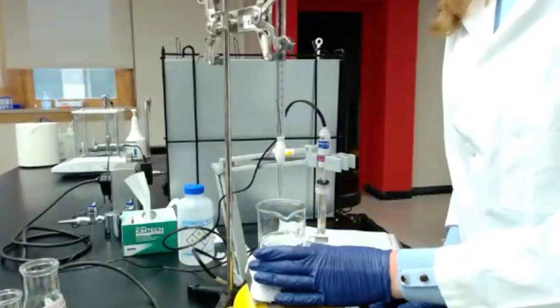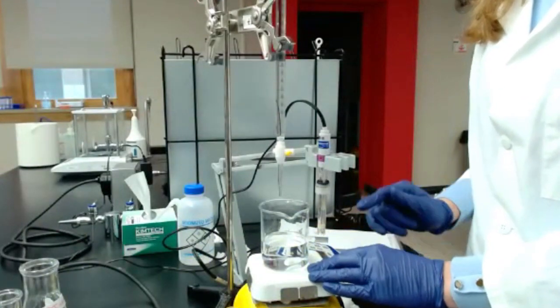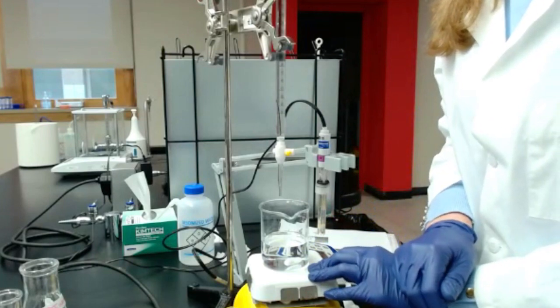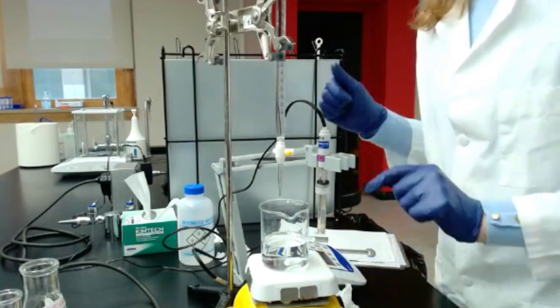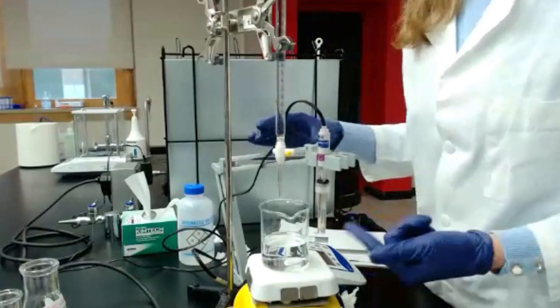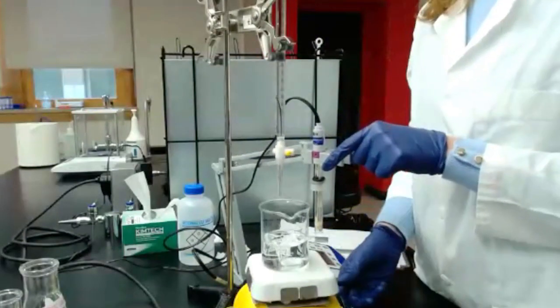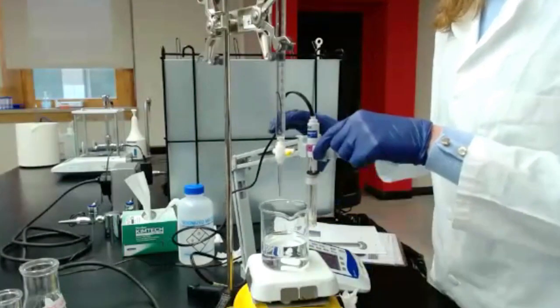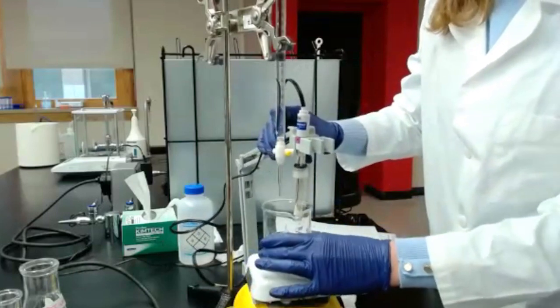So that's what we're going to start by doing: looking at the pH, making sure the pH of that solution reaches 8.2. pH 8.2 is the target, by adding sodium hydroxide. But to do so, we need to make sure the solution is under stirring, and also that we put the pH probe in. It's stirring very fast, so I'm stopping for the moment. But the pH probe and temperature probe, if you have 2 separate things.